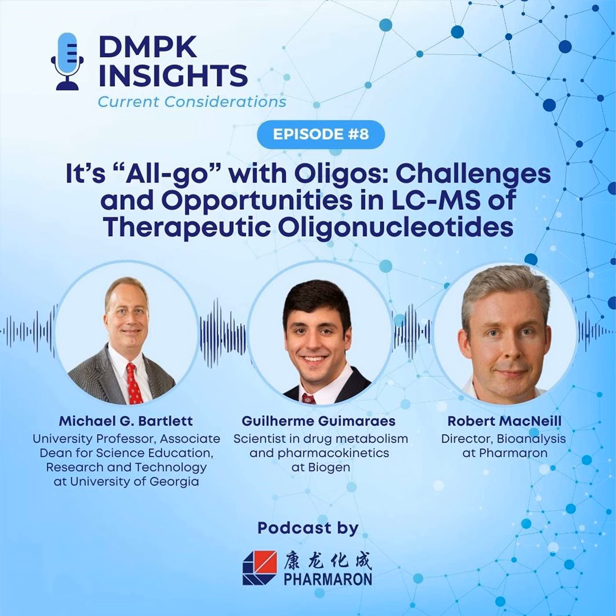Yeah, absolutely. And that was one topic of discussion. We recently attended ASMS, and there was an interesting oligo workshop group discussion, and these were some of the main topics we discussed. Right, a lot of oligonucleotide manufacturing as well as characterization is done in Europe, and so some of the groups were bringing their own perspective to the table, and what people are planning to do, and how they're planning their workflows for the potential of either higher regulations or something along those lines. Yeah, and that was the birthplace of the HILIC hashtag for that workshop, right?